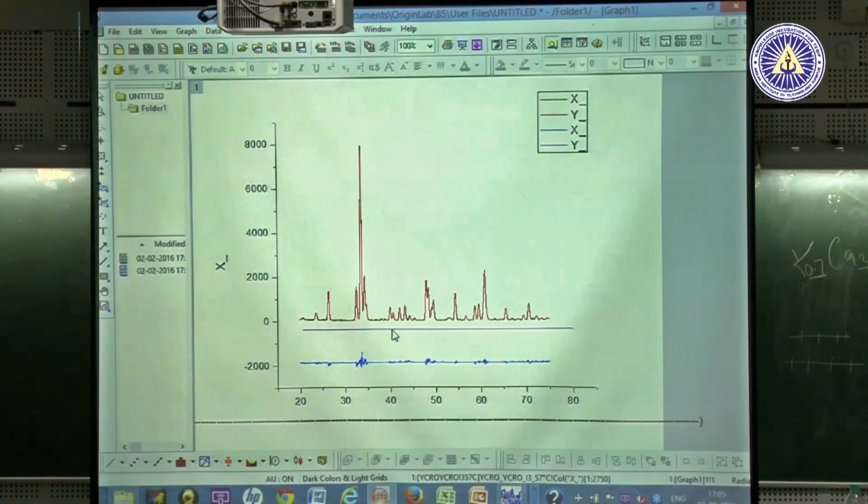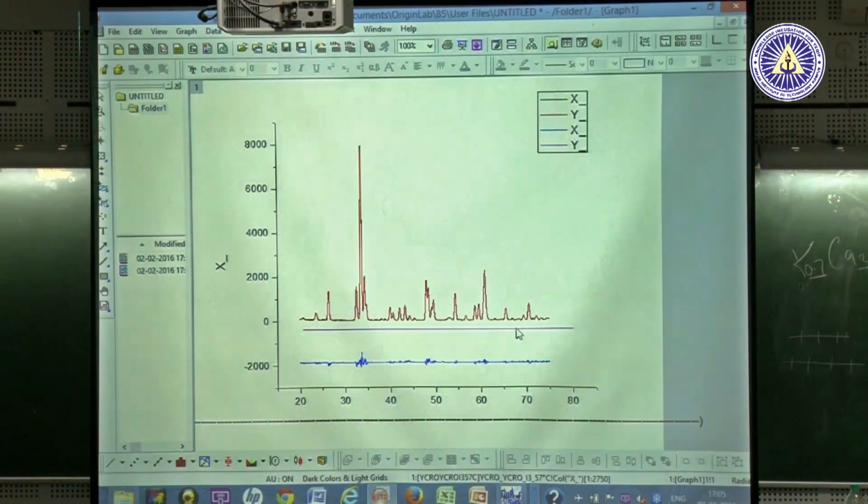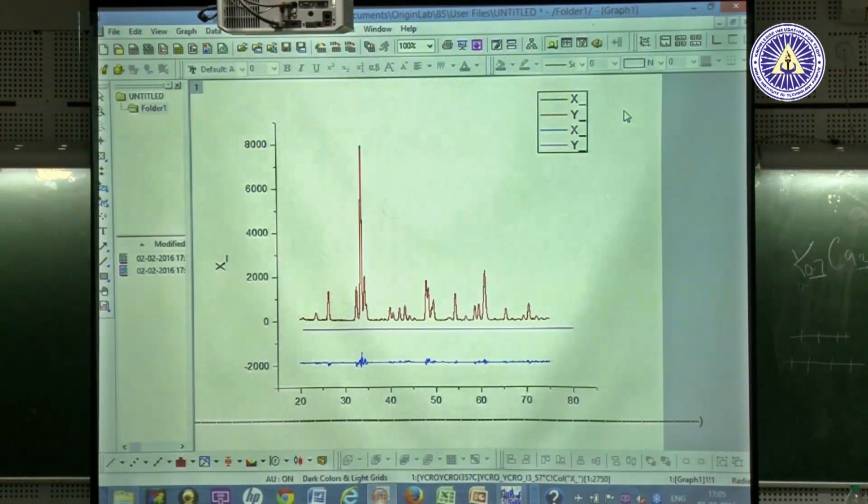Okay. The red one is the standard experimental value, the black one is merged here. It's your practice, just check the symbols and all things, and the difference is also here. I think nobody is having a problem here. Okay.